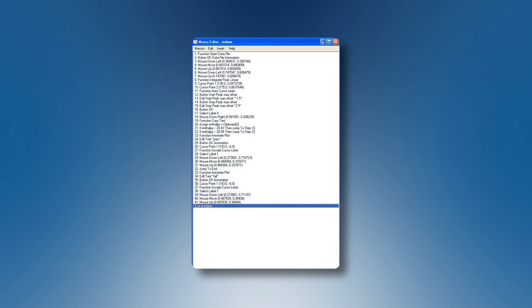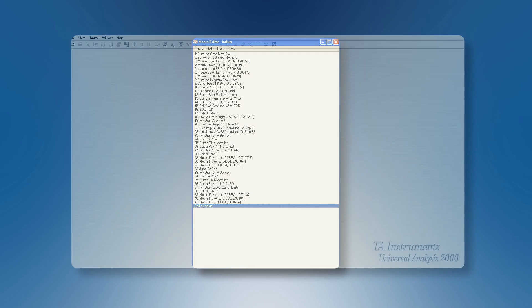This TA Tech Tip is on how to create a pass-fail macro. Such a macro is designed to perform an analysis, compare the result with a predefined value, and post a pass-fail message depending upon the result of the comparison. We will create as an example a macro that calculates the indium melting enthalpy, comparing it to its theoretical value of 28.71 Joules per gram. If it deviates more than 1% from this value, we will post a fail message.